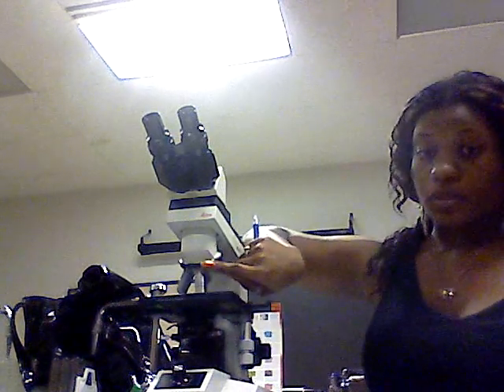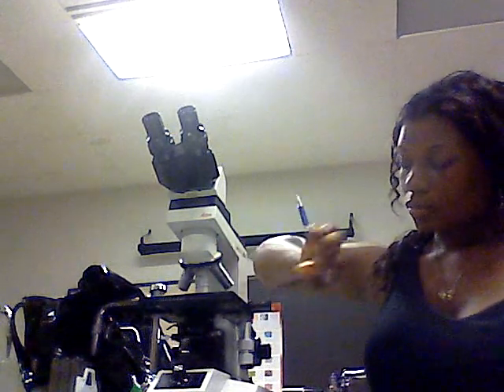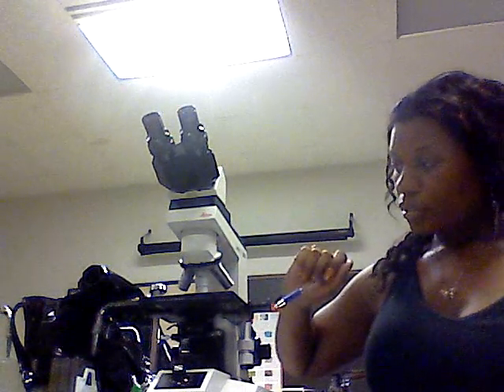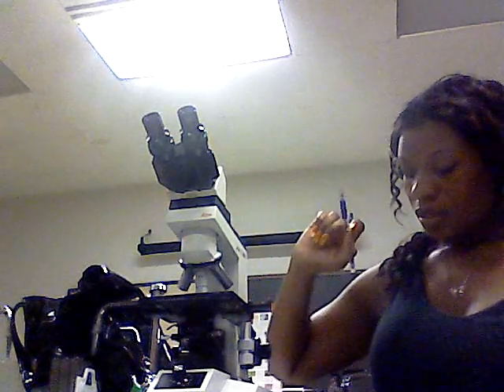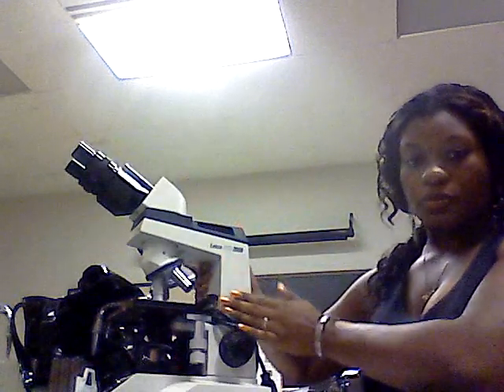The nosepiece and the objective lenses are these — I call them objective lenses. The stopper screws are up here on my microscope. The arm of the microscope is right here.